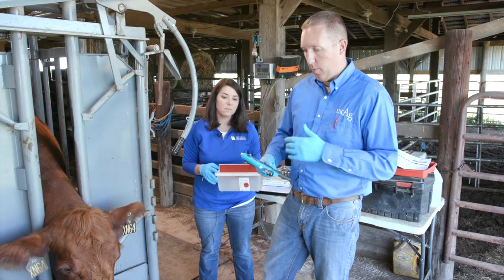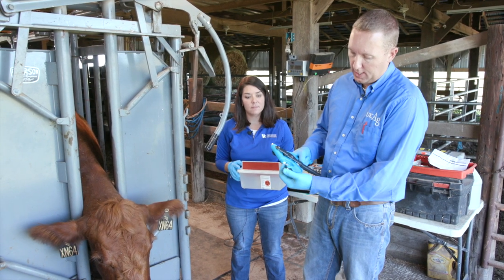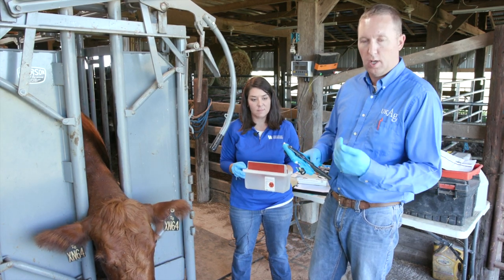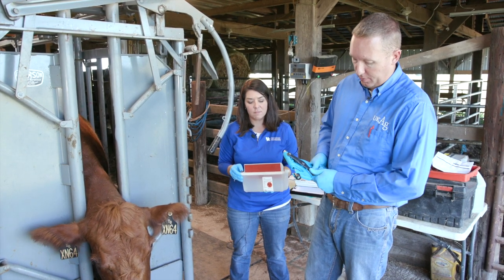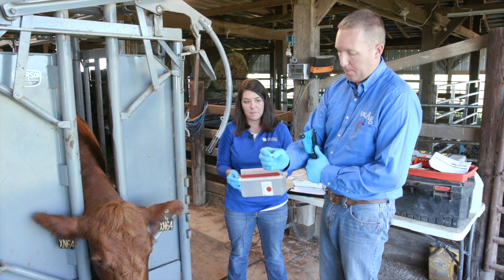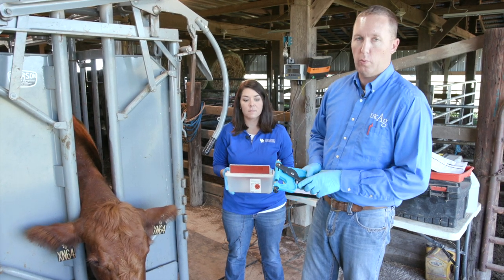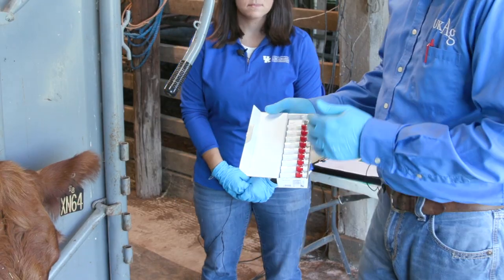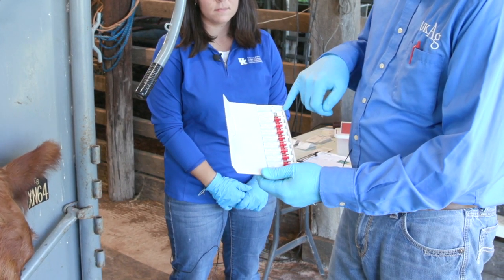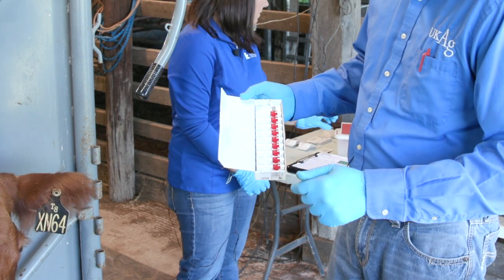We've taken our sample and now we have our gun. The last part of this process is to remove the cutting edge of the previous TSU — these are never used on multiple occasions. We simply pull the handles apart and the TSU pops out, then we put it in a sharps container to be disposed of properly and only use it on one particular animal. Once all samples are taken for the day, double-check to make sure the corresponding numbers match the cows utilized in our sampling today.